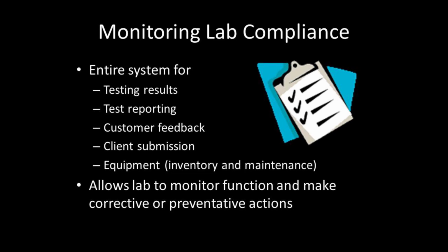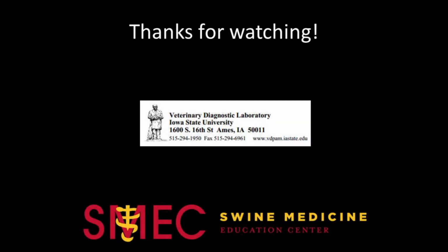Although the quality assurance program may not be the first area that comes to mind when you use the diagnostic lab, it is essential to proper lab function. Virtually every testing parameter and procedure is monitored to provide you with accurate and high-quality results. This concludes Video 3, demonstrating the processing of cases through the Iowa State University Veterinary Diagnostic Lab.